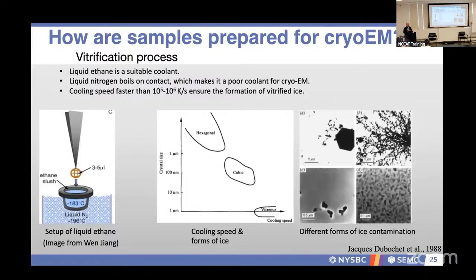There can be the opposite side of this phase transition diagram, because if you heat up to a nice balmy, I guess, somewhere around negative 137-ish degrees Celsius, you can go from this amorphous water to ordered water and crush your sample.